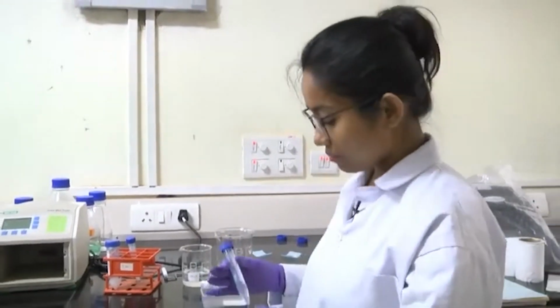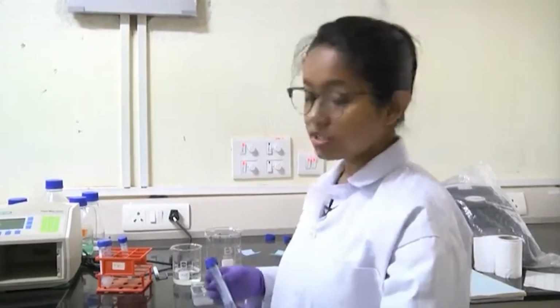If it is a highly specific antibody, then you go for 1:10,000 or something like that. So 1:10,000 means in 10 ml you will give just 1 microliter of primary antibody. Or if it is not that specific, then you go for 1:5,000.